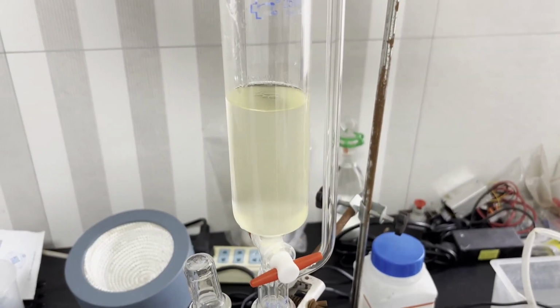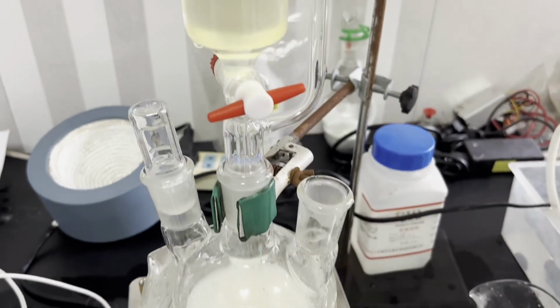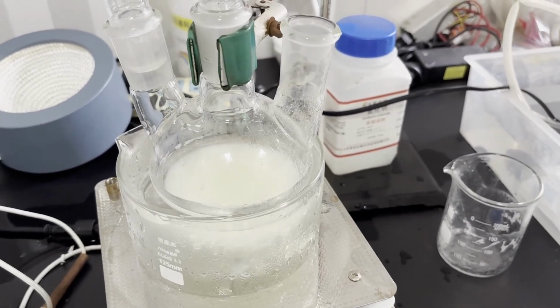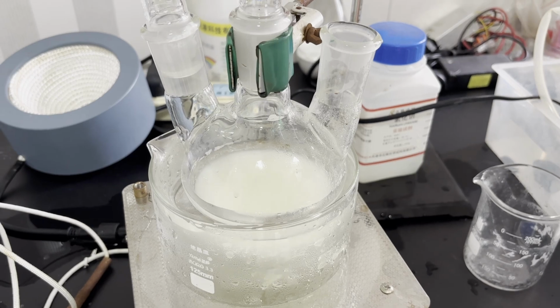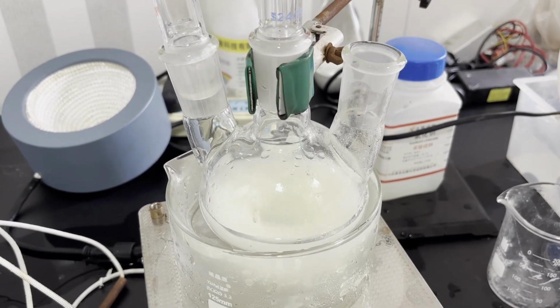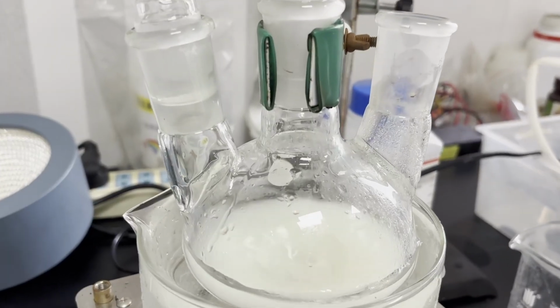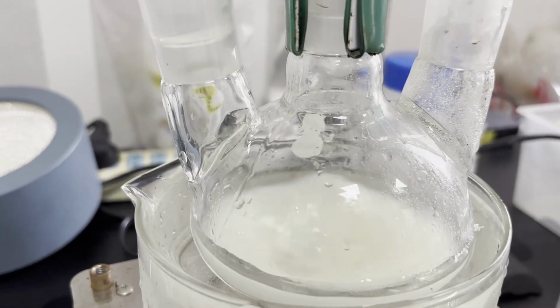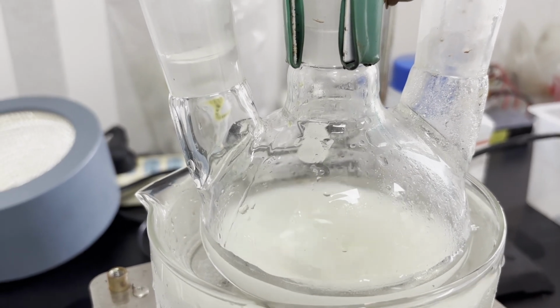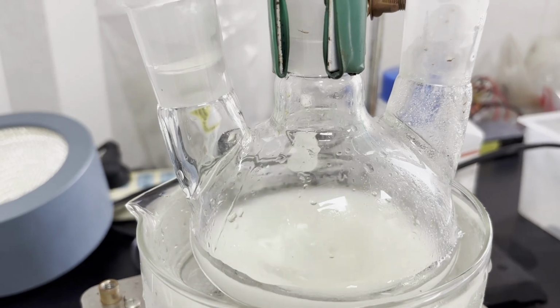150 ml of not so pure 20% hydrochloric acid, previously chilled to 15 degrees C, is added to the dropping funnel. Despite that many procedures claim that cooling to 0 degrees C is necessary to ensure good yield, I still obtain a fair amount of product even if my reagents are only chilled slightly. Very strong stirring is started, and the acid is slowly added to the flask. To my surprise, not even traces of nitrogen dioxide gas evolved, and nothing seems to happen. I added the acid even faster, but still no gases are seen.